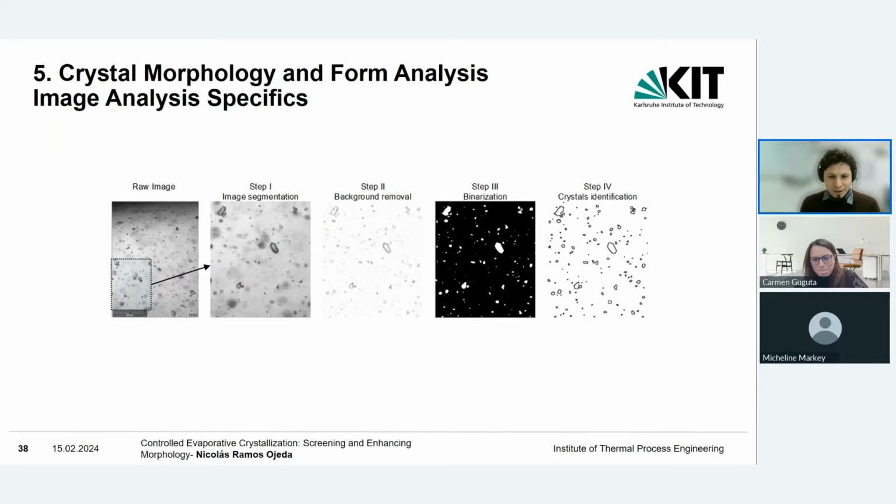So in that way, we just have to focus on performing the same supersaturation, keeping the temperature and the same solvent, so we try not to have those issues, because that would make the whole problem complex in the validation.